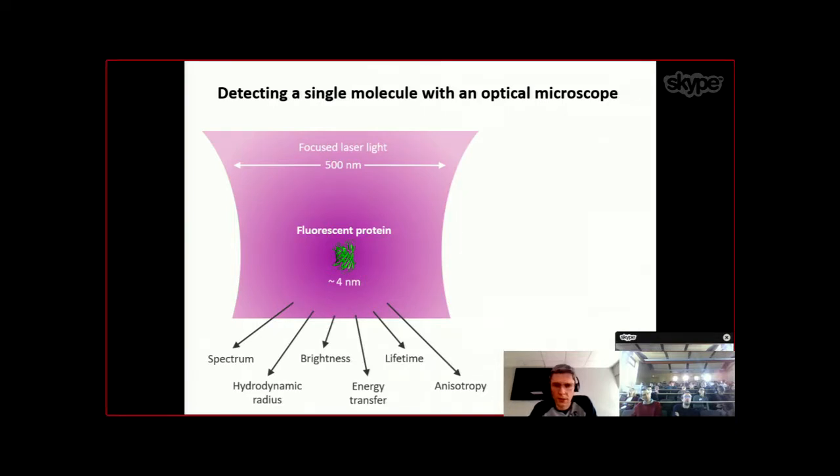But then you tell me, okay, I don't care. I put milliwatts of laser power and whatever gets excited. But there is a physical principle in general physics that if your system is lossless, then you can reverse time. Whatever goes in one way, meaning light to the molecule, this is one direction. Then if it's lossless, it should go also the other way, emission to the microscope. So if your excitation is inefficient, then for a lossless system, your emission is also going to be inefficient.